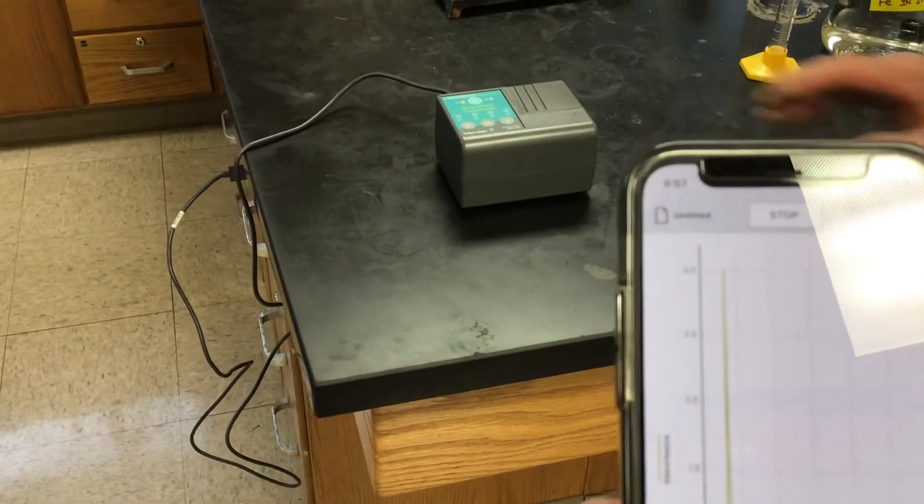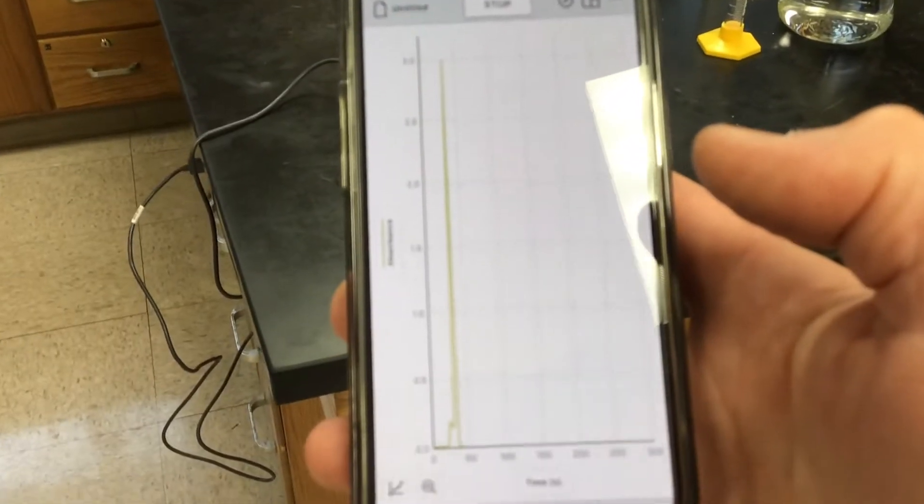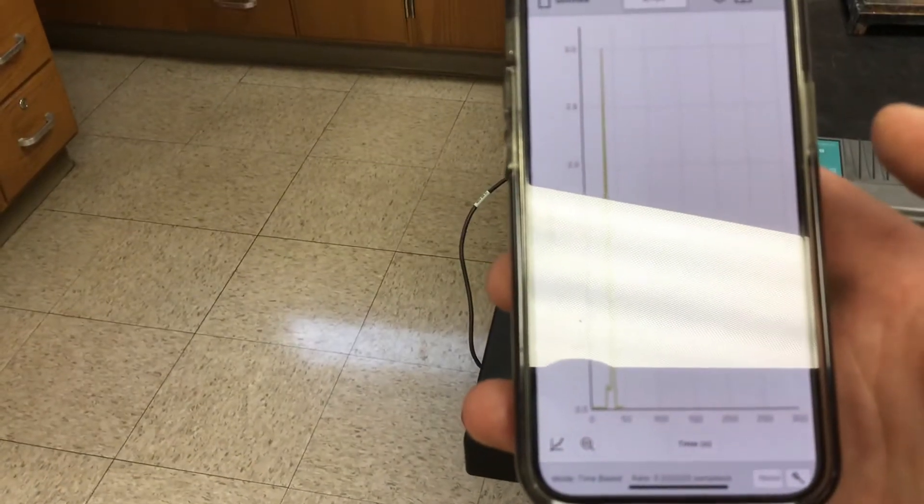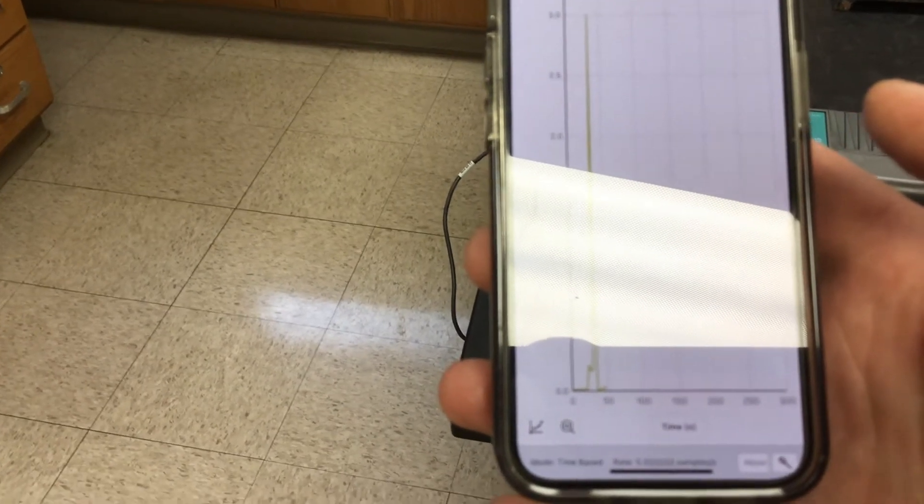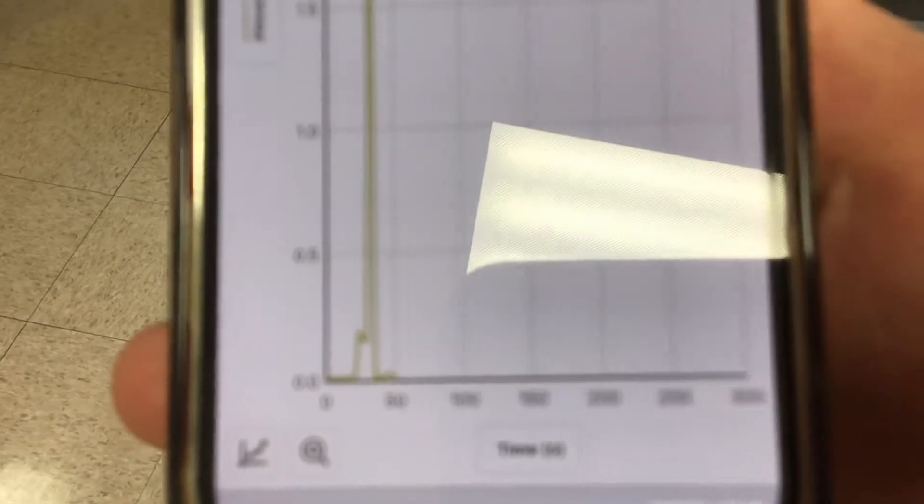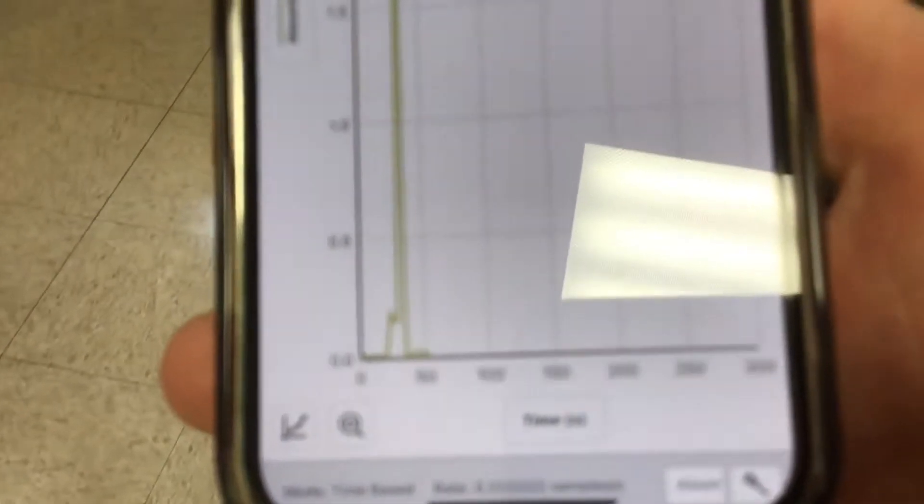Okay. And that should send, oh, see it made a spike, but now it's running along the bottom there at zero. Right. So we're setting it. So it's meeting zero absorbance for the cuvette and for the DI water. So any light that's absorbed should be just due to our solution.